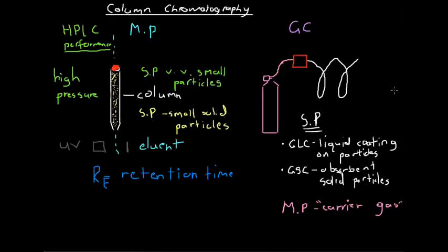And so what happens is, again, we have our red sample here, and we inject it into this red box here. And this red box is the injection port. And so how everything works is this whole region, so this injection port and the coil and the detector, which I'll explain in a minute.